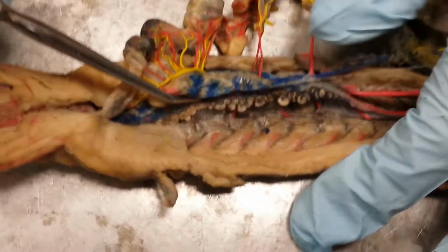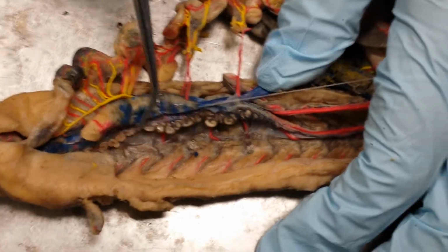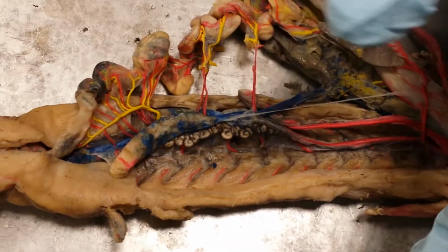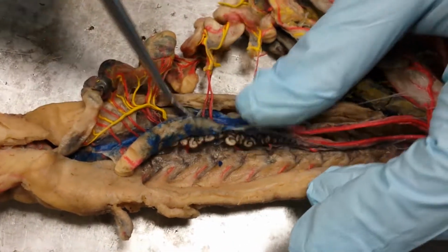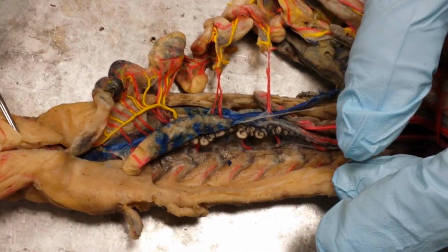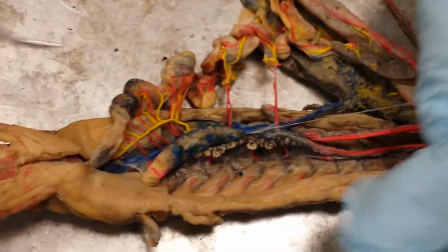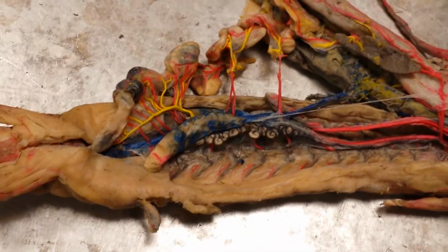Okay, and I don't know if I pointed this out last time. These squiggly lines here, those are the archinephric ducts. Okay, or vas deferens, whatever you want to say. I think I told you like the first day it was vas. It doesn't matter. However you learn it.